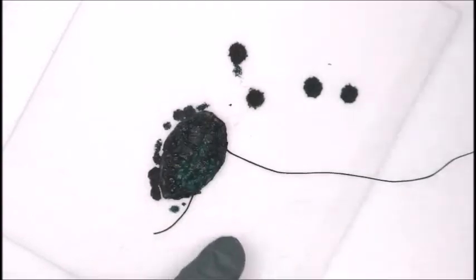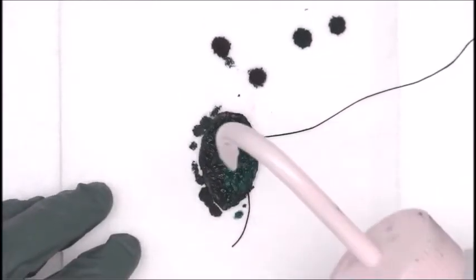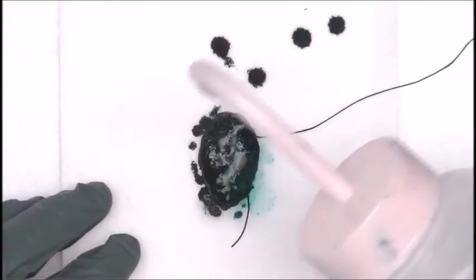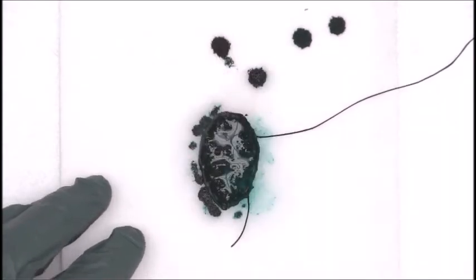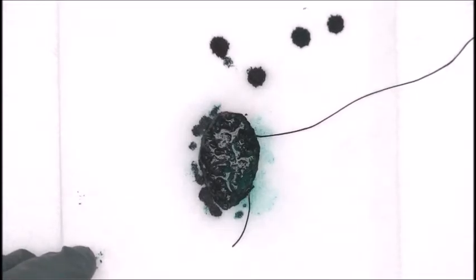Just like that, okay? And then what we're going to do is throw a little bit of vinegar on it. Let that vinegar make the ink stick. I'm going to dry this off and come back to it.